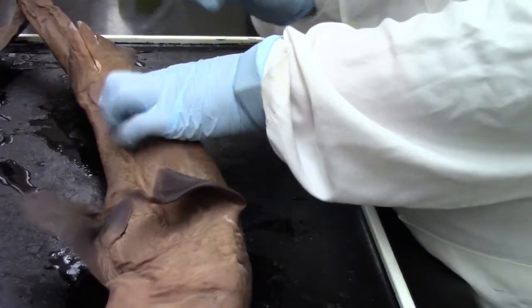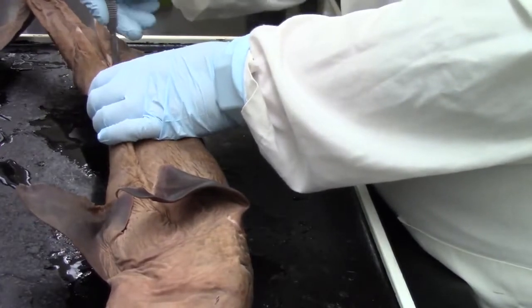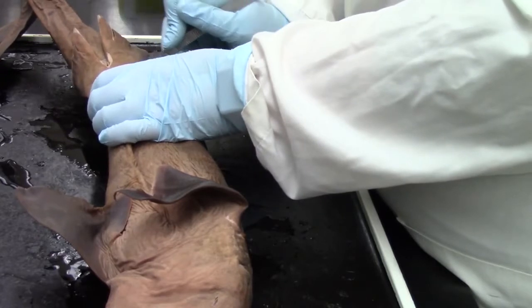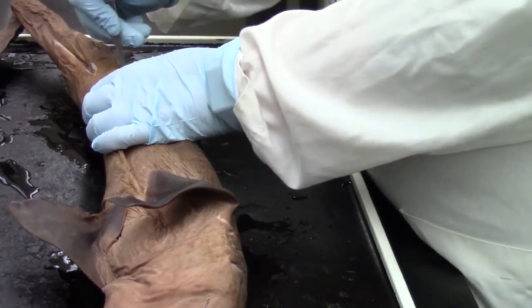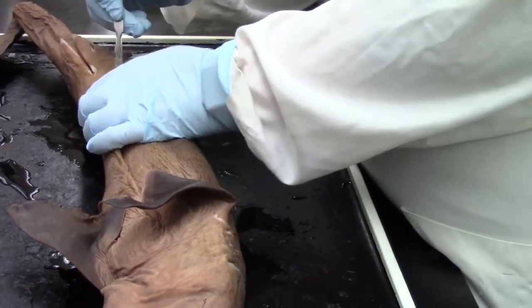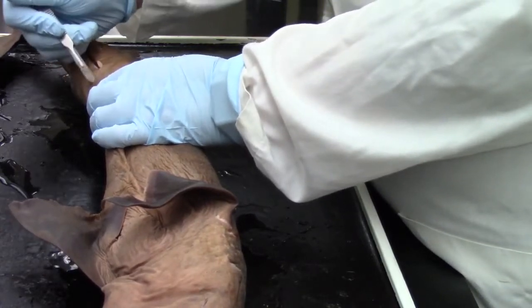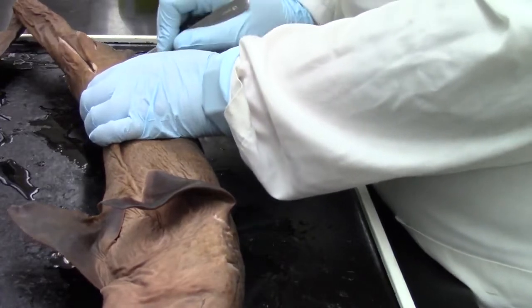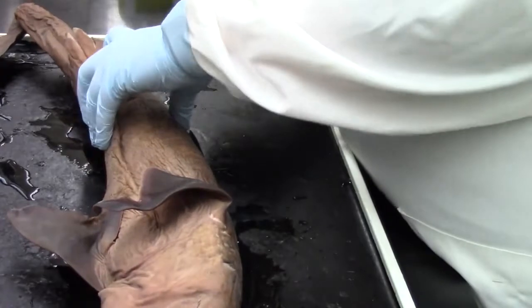So here we go, we'll start cutting. It is important to note that the skin of the dogfish, these scales have almost a sandpaper-like consistency. So they can be a little bit difficult to cut through, and they can also dull your scalpel blade rather quickly. So it's important to keep an eye out on that and make sure that you're just performing your dissection safely.